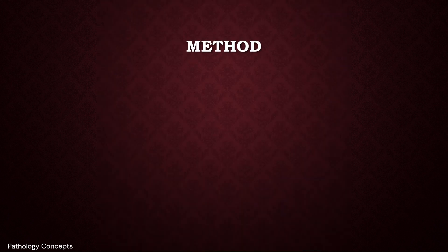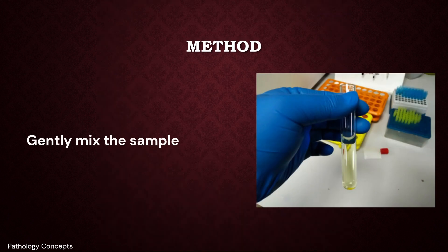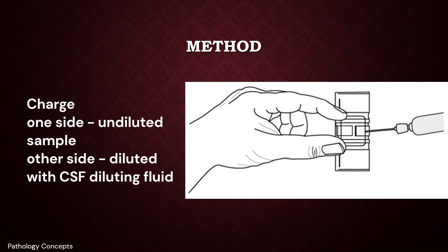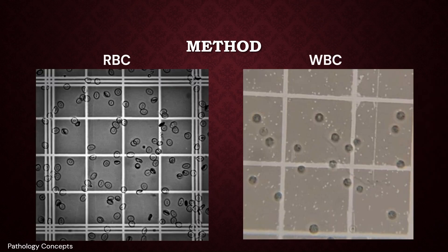Now let's see the method of counting. First, gently mix the CSF sample. Charge one side of the Neubauer chamber with the sample without any dilution. Charge the other side of the Neubauer chamber with an appropriate dilution with CSF diluting fluid. Let it stand for 5 minutes and observe under the microscope.